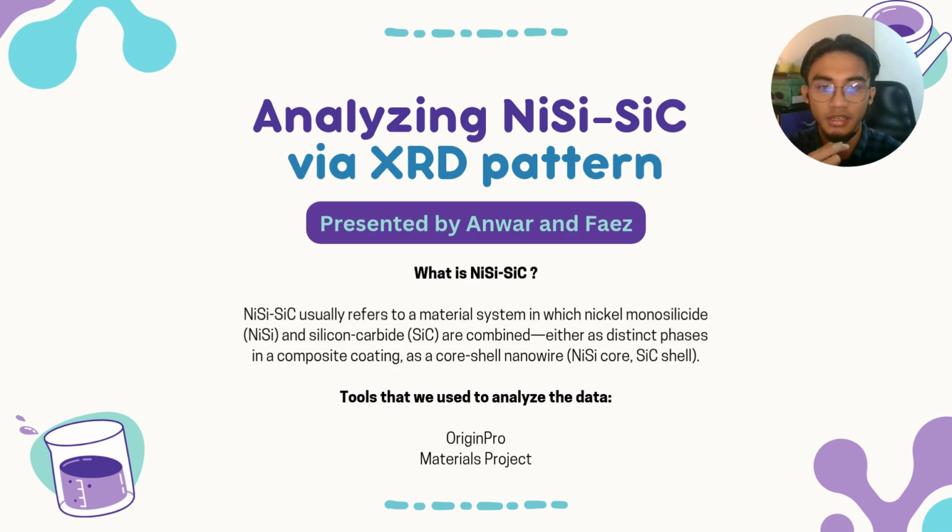So what is NiSi-SiC? NiSi-SiC usually refers to a material system in which nickel monosilicide and silicon carbide are combined, either as distinct phases in a composite coating or as a core-shell nanowire, where NiSi is the core and SiC is the shell. The tools that we use to analyze the data are Origin Pro and Materials Project.